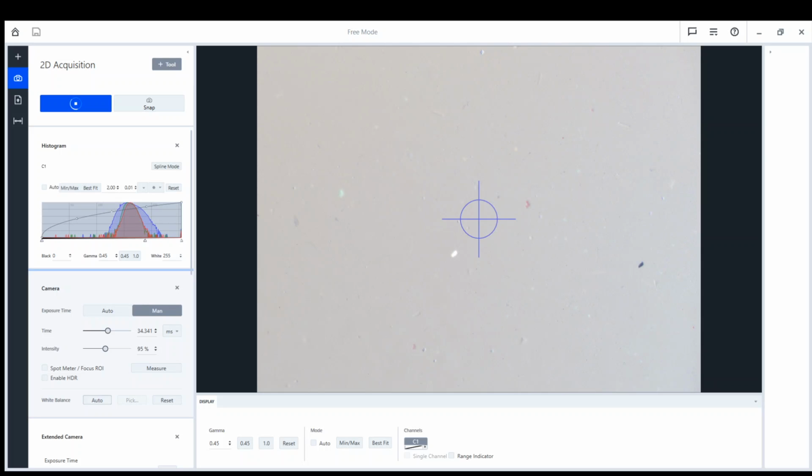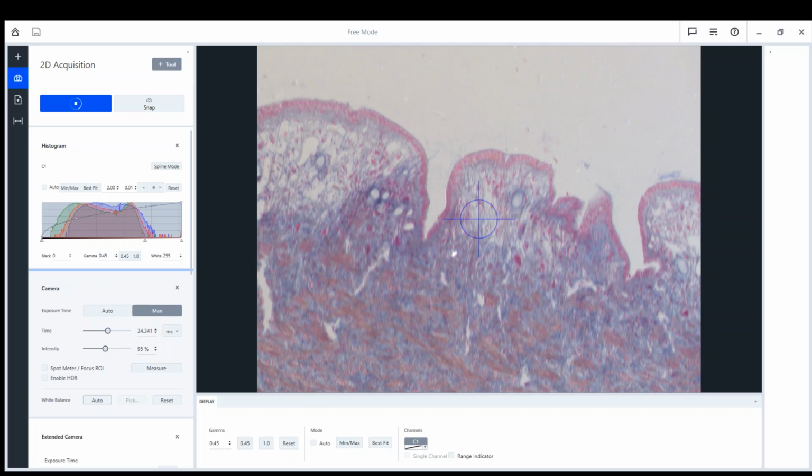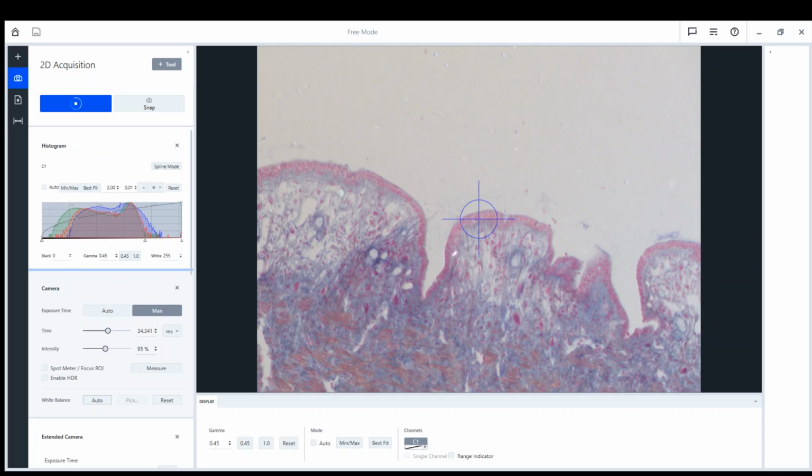And you see the picture has now gone to basically a grey image. It's still colour, but because we've got the RGB aligned, the image appears to be grey. Now this means when I go back to my sample, over here we have a nice grey background and a correct coloured sample.